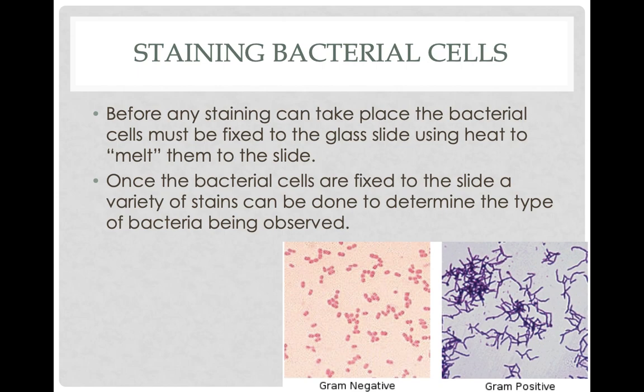It does one of two things. If you've ever gotten anything slightly wet or slick on glass and you add water to it, it just washes away. This is the same concept here. If you just stick bacteria on a slide and then try to add some stain to them, it's going to wash away. When you go to look at it, the bacteria just washed away by the liquid stain. So you're going to want to make sure that you stick them to the slide. This process does two things. It kills the bacteria, which is what we want. We don't want live bacteria. And it's also going to glue them to the slide.